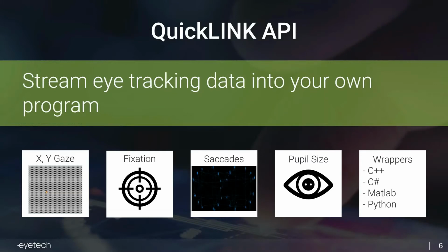We do also have an excellent quick link to API, so you can stream the data into your own program, such as XY gaze data, fixation, saccades, microsaccades, pupil size, and then we have wrapper support, including C++, C#, MATLAB, and Python, to name a few.